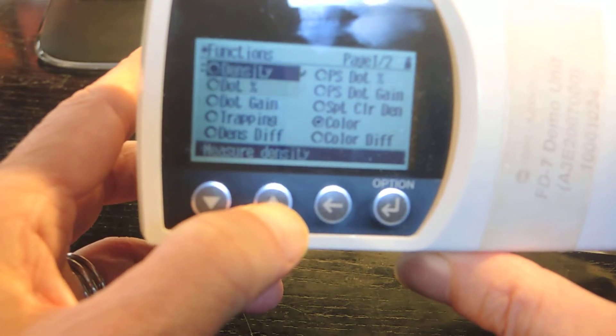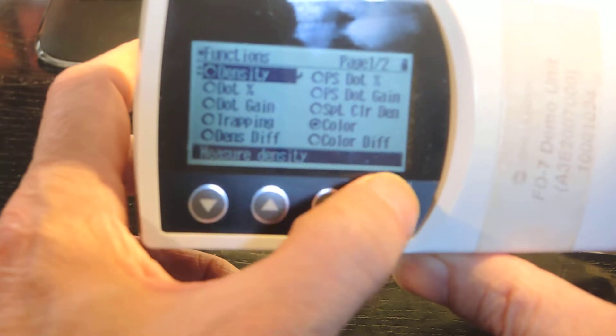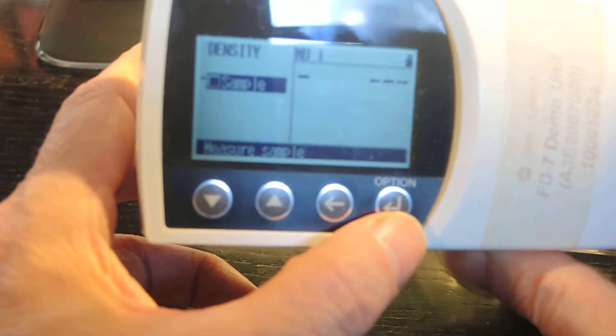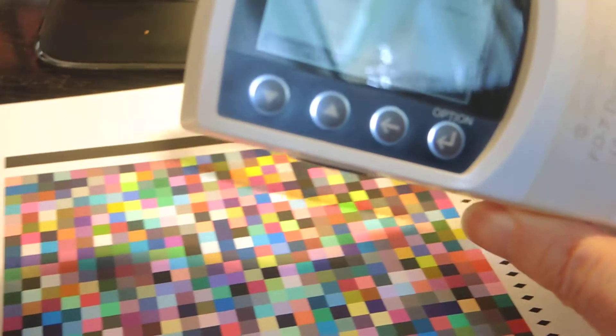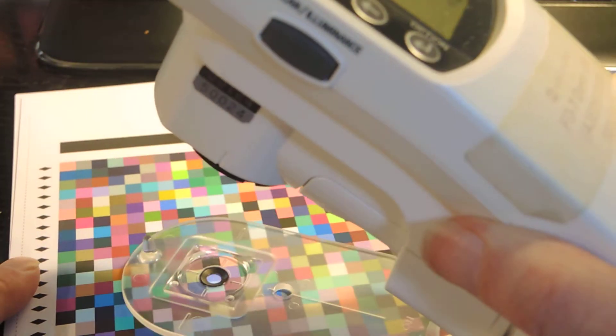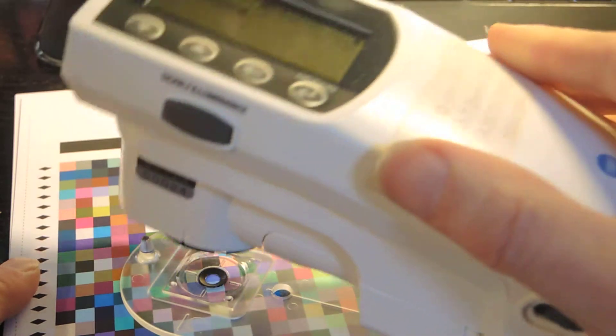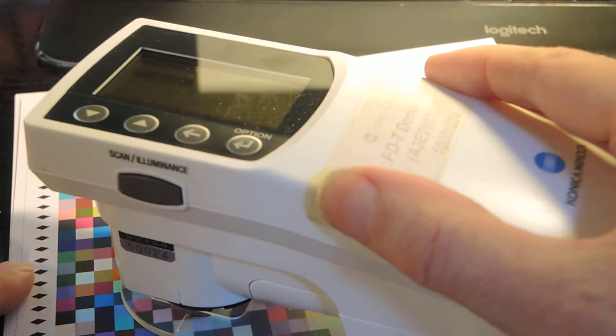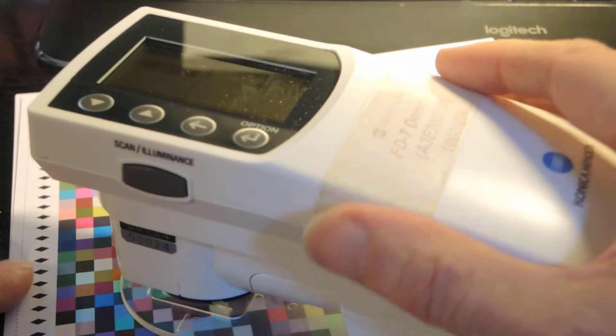The first one at the very top here is the density. So if I press here and I measure something, I guess I'll get the density reading. So I want to try again with my chart from yesterday, place it on the chart anywhere.